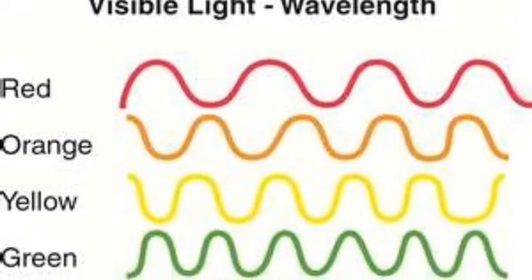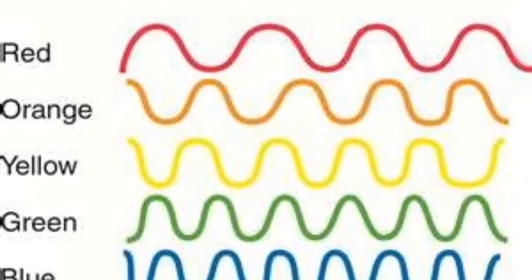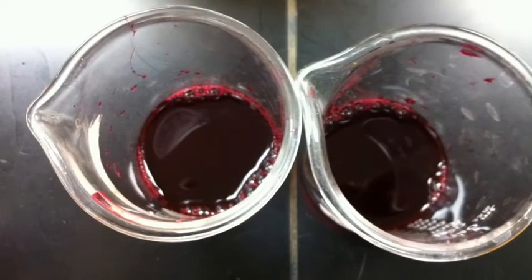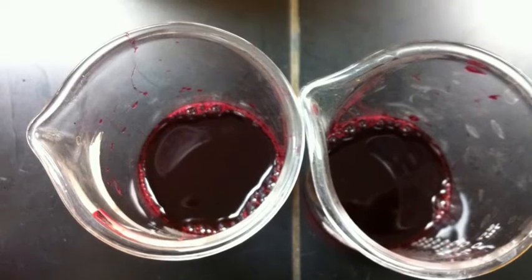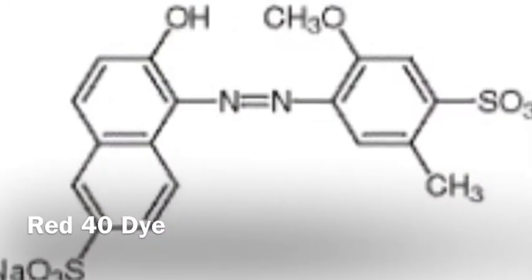We took an interest in studying how pH level affects the wavelength of max absorption of a synthetic versus a natural dye. To conduct such research, we tested the effects of varying pH levels on red 40 dye and beet juice. Both dyes are a similar deep red in color, and structurally, they share a similar number of double bonds when comparing the color-producing betalain ion to the red 40 structure. But the red 40 dye has an azo bond, which likely strengthens the red color of the dye more than the natural beet juice.